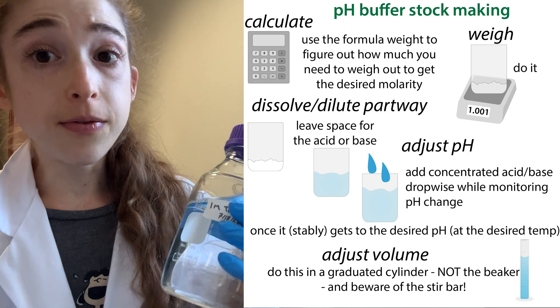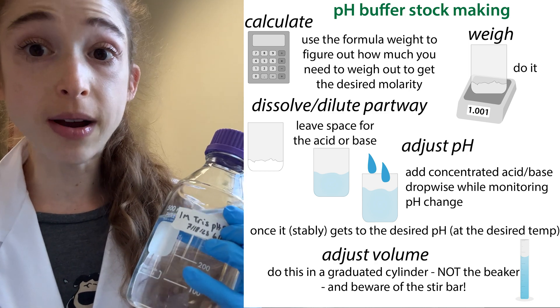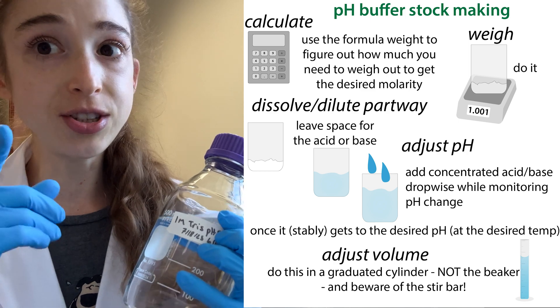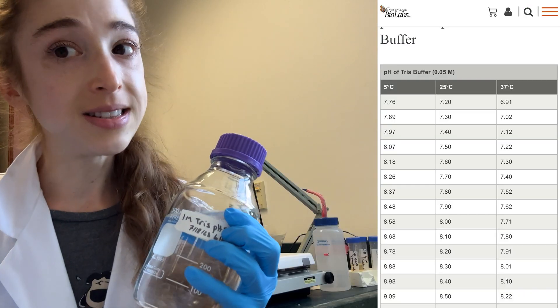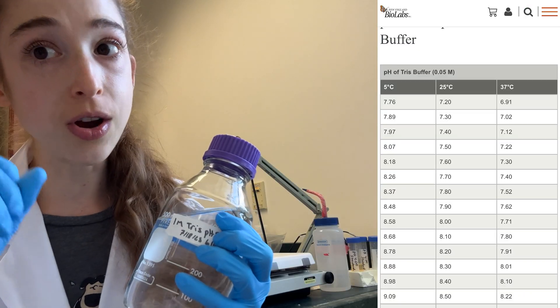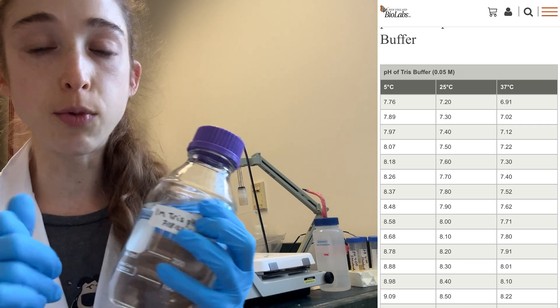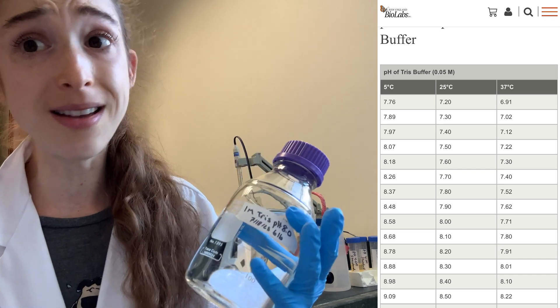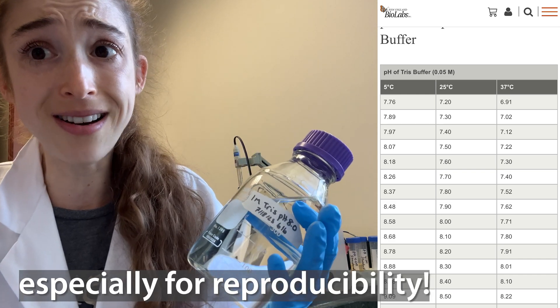So that's the basics of remembering to pH your buffer and do it at the temperature you want it at, because that temperature can affect things. As you go down in your temperature, you're going to go up in your pH. You're going to make things more basic, fewer protons around, which might have an impact, might not, but it's better safe than sorry, right?